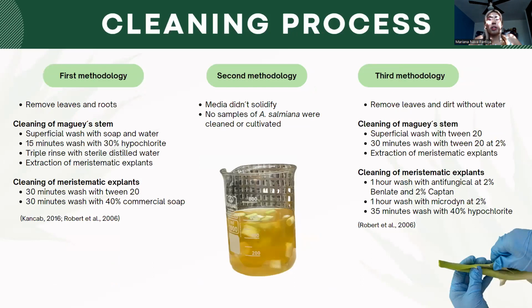So we also had several cleaning processes. On the first methodology, we had a more general cleaning process with shorter periods of time for the washes. However, for the next cleaning process that we developed, that was for the third methodology, as for the second methodology, the media did not solidify, which meant that we had no samples of Agave salmiana that were cleaned or cultivated.